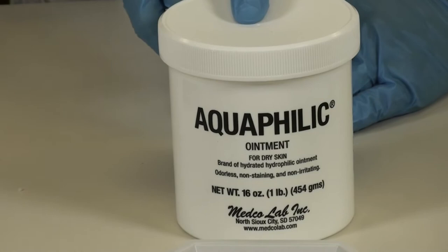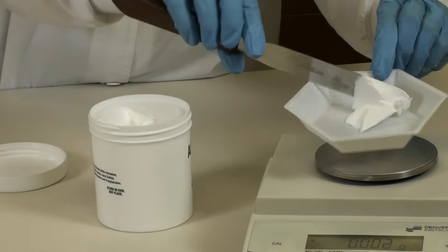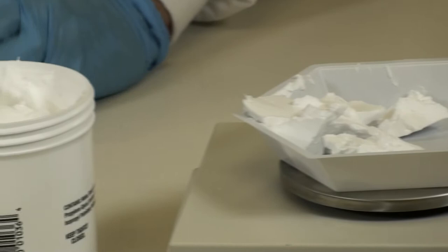Weigh the required amount of aquaphilic. Put a large weigh boat on your scale and weigh the required amount.